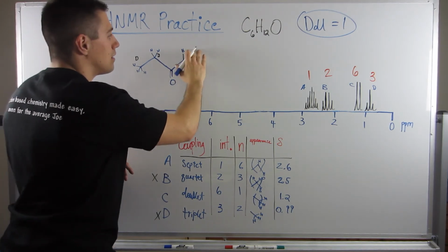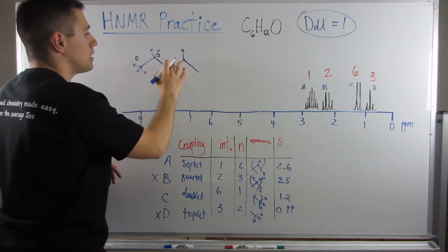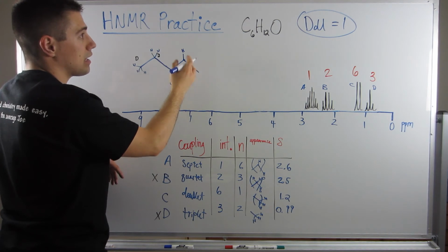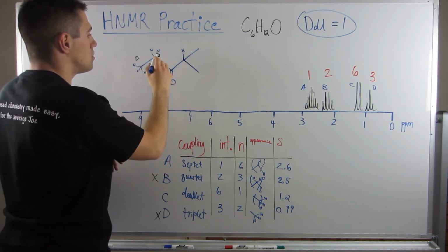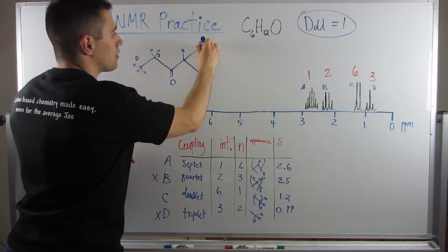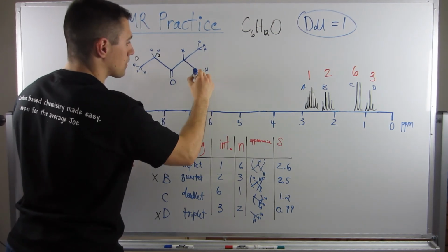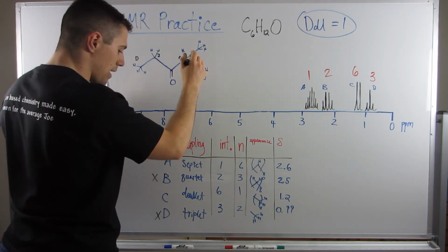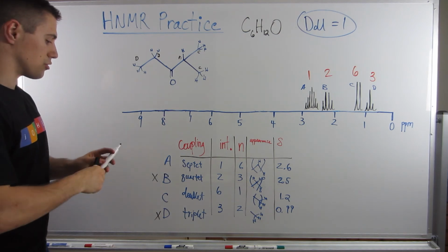So I can't have that. Well, remember, we've now used 1, 2, 3, 4 carbons if I continue that. And I have 6. So if I do something like this, 1, 2, 3, 4, 5, 6, right? There are my 2 methyl groups, right there from letter C. I'm left with my 1 hydrogen right there for A. Bingo, bango, bongo. That is the deduced NMR structure.